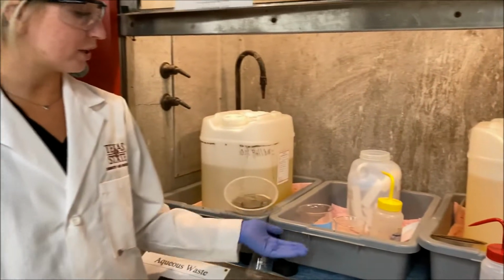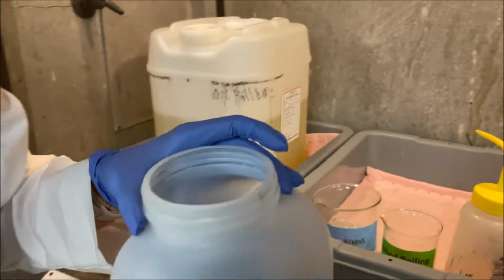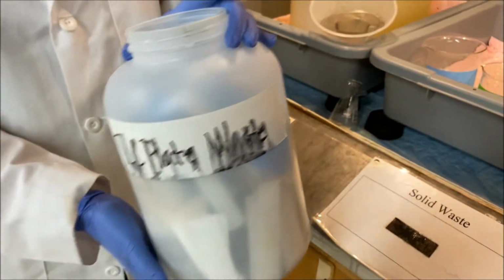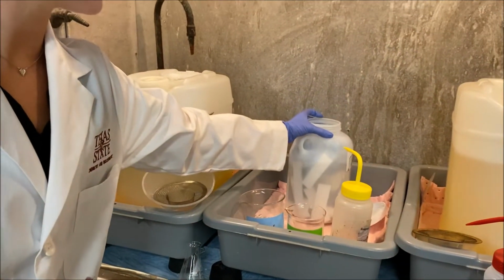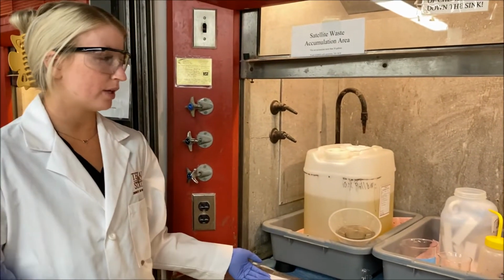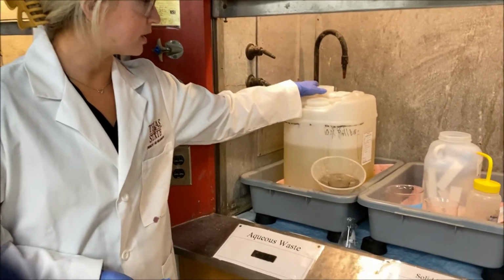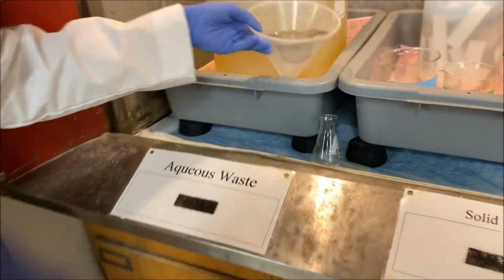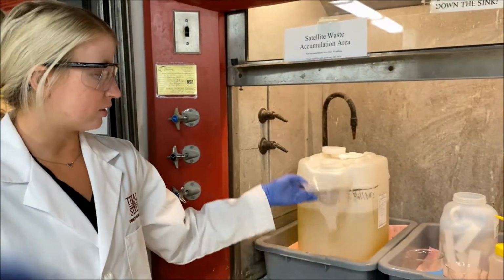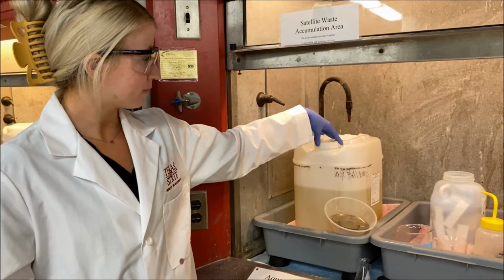And then in the middle here, you'll have solid waste, which you can see right here. You'll have a bin like this, and you can see the inside is just filled with solid waste, such as silica gel plates, contaminated weigh boats, and things like that. And then next to it, you have your aqueous waste, which is the same thing. You'll open and close it. Open when it's in use. If you need to catch anything, you'll use the funnel and the strainer, just like the other bin. And then when you're done with it, when it's not in use, you'll just close it right back up.